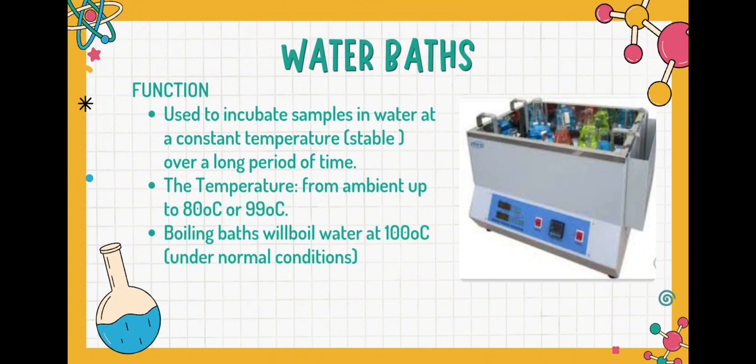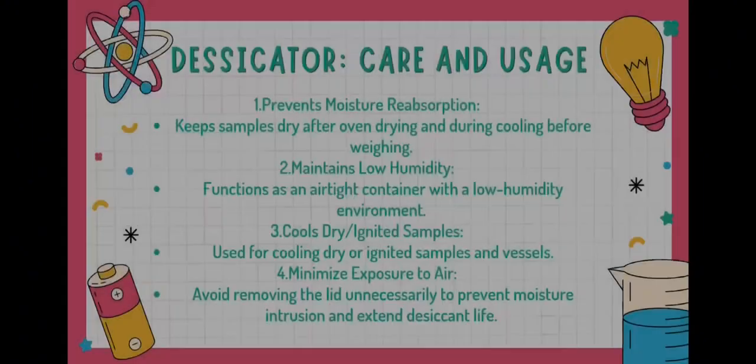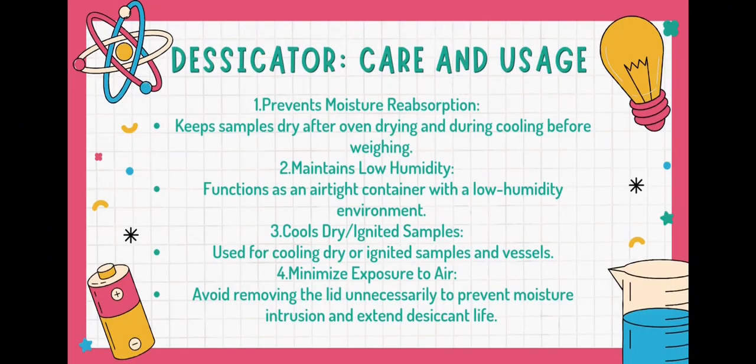A boiling bath will boil water at 100 Celsius under normal conditions. Now I would like to explain about the desiccator, its care and usage. A desiccator is a device for drying a substance or sample.